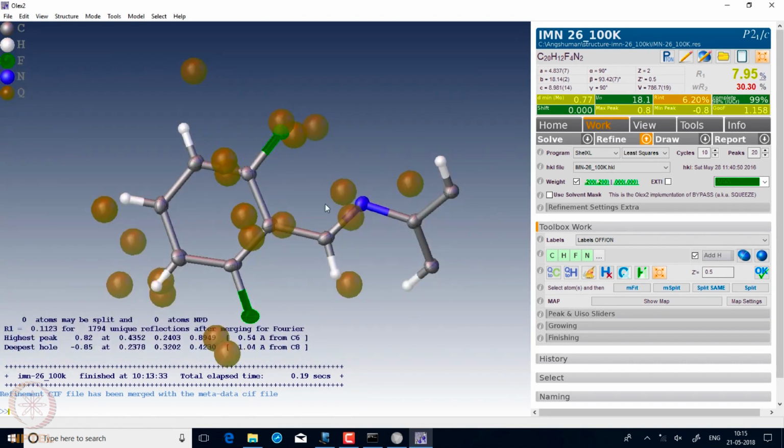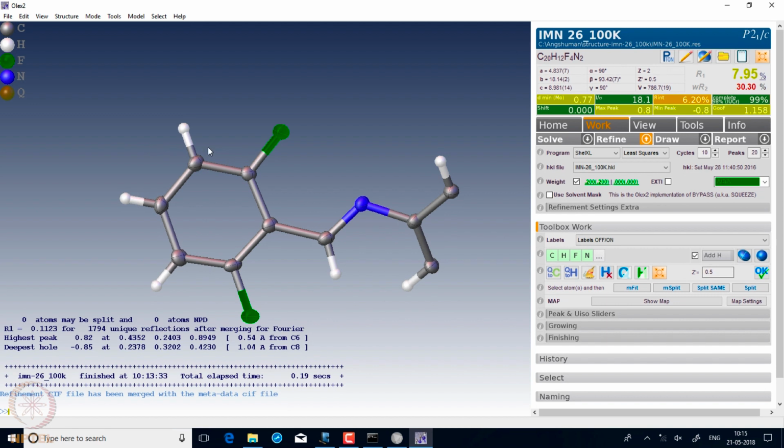So here, if we try to see what the distance is, if you bring the cursor to the bond, it shows that it has fixed that hydrogen at 0.93 angstrom from the carbon. All these being aromatic hydrogens, they are all fixed at 0.93 angstrom.